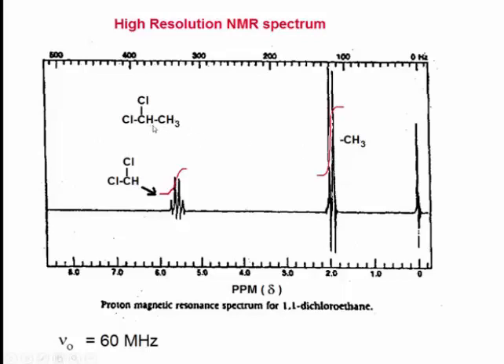Now the methine hydrogen as a signal proton, as it plays out, is going to be influenced by the neighboring CH3 hydrogens. The neighboring CH3 hydrogens are going to magnetically influence the methine hydrogen, causing it to be split into a multiplet of 4 peaks.